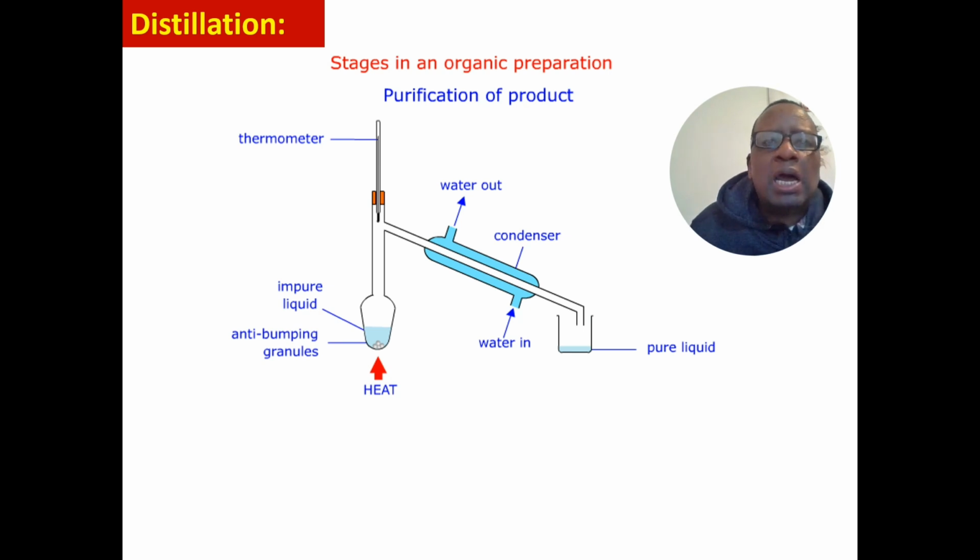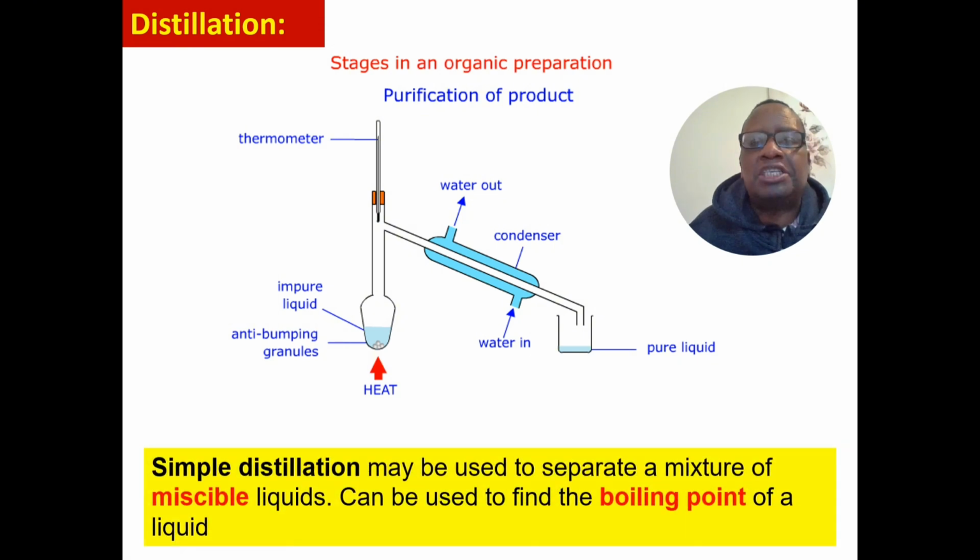Right. If you reflux, remember, if you reflux, you go to a carboxylic acid. But with this one, we put our primary alcohol in there and we add acidified potassium dichromate and distill. We form an aldehyde.